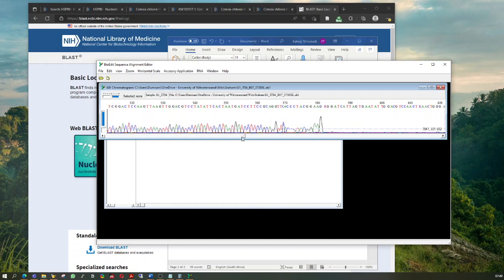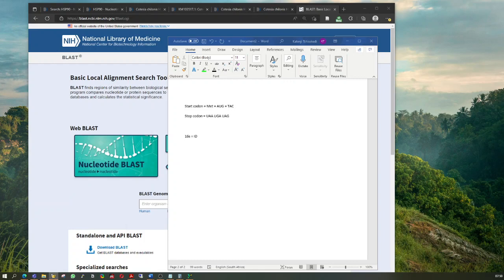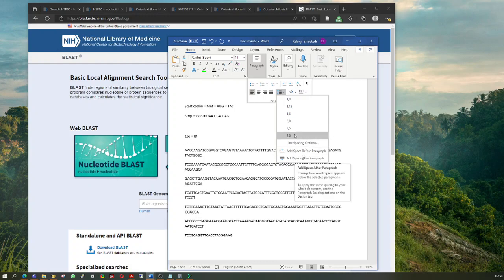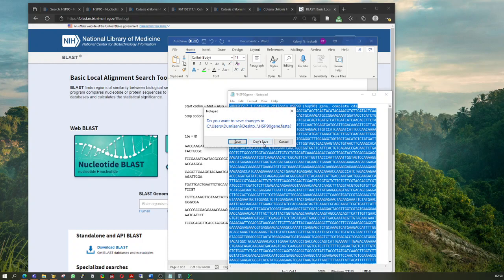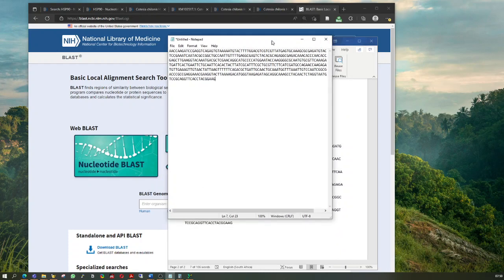But you saw this one from sequencing as well when we studied it, that we usually get our file as a chromatogram, and at the highest peak you make a call that this is guanine, adenine, and all that. You did all of that, and eventually what you landed with was a sequence like this. But in all honesty, this is just data, this is information, and you cannot really tell what this is just by looking at it. Maybe let me paste it in a notepad to make it easy for us. So you just have this. You don't know what it is, you called the nucleotides, but you need to find out what it is.